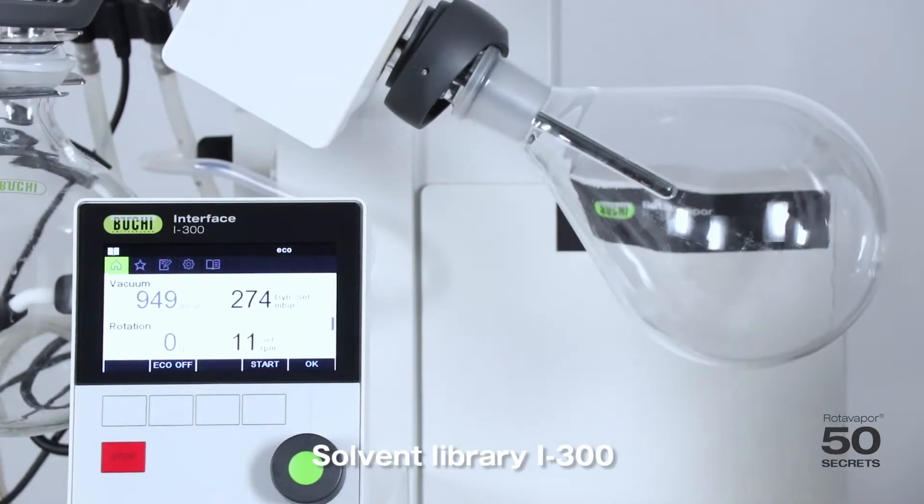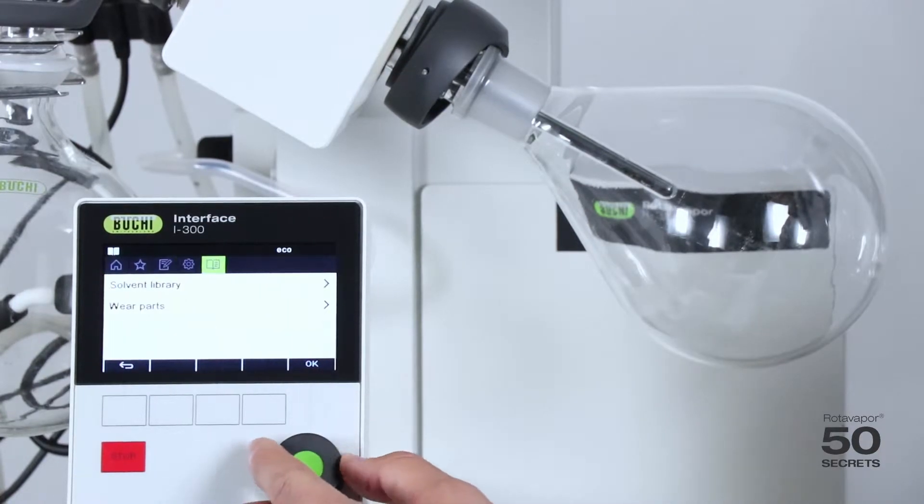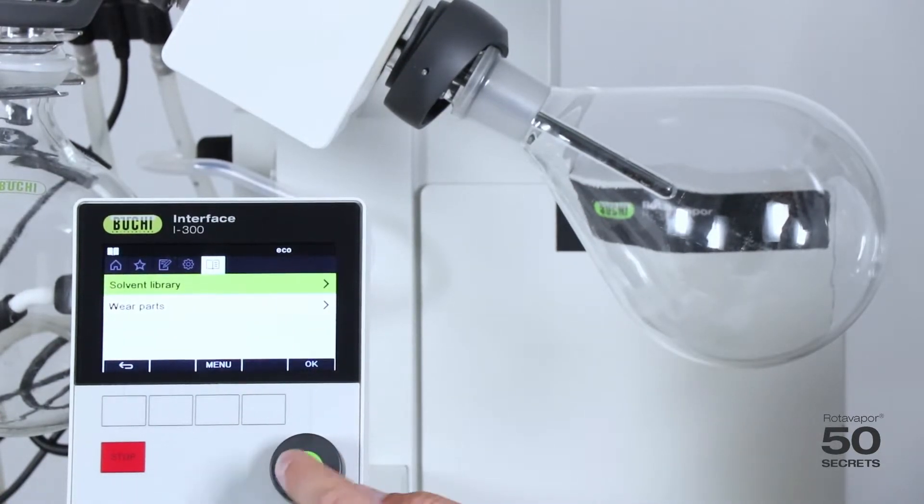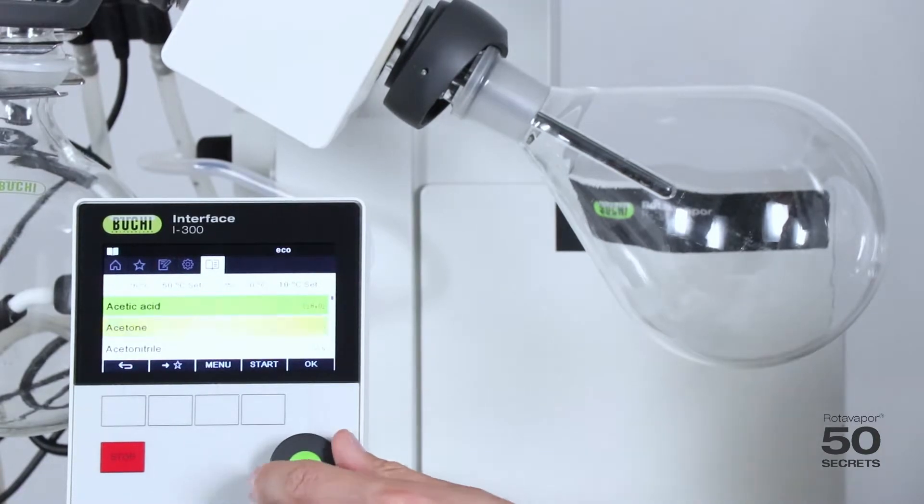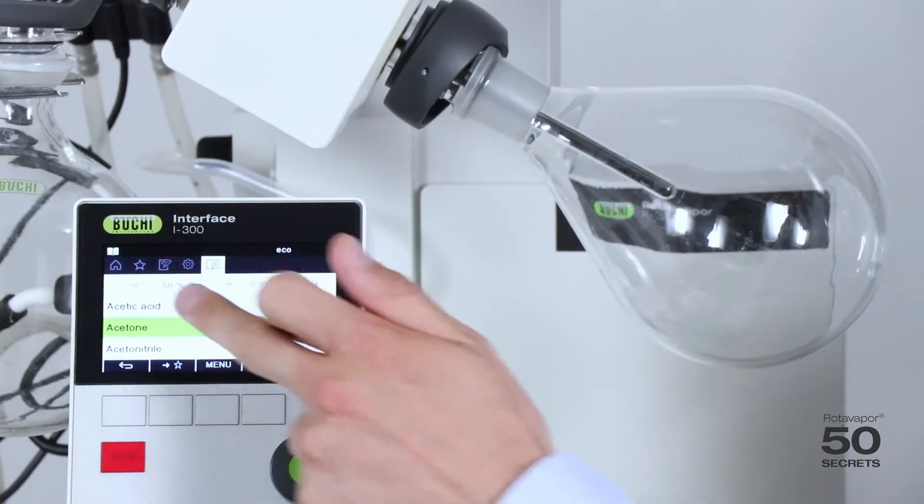Let's talk about the solvent library on the i300. We can simply go into the menu and just scroll to the same library icon. Go into the solvent library and in here I find exactly the same list. I can use exactly the same functions.